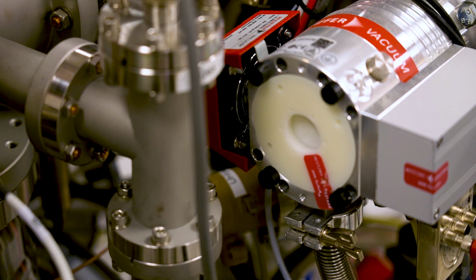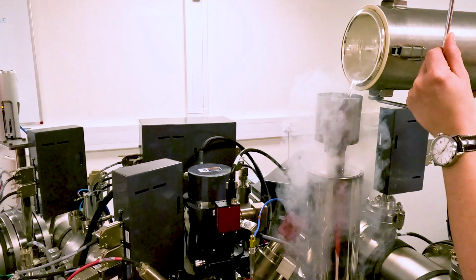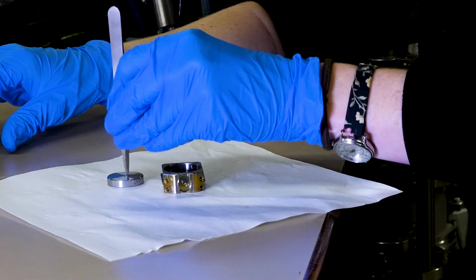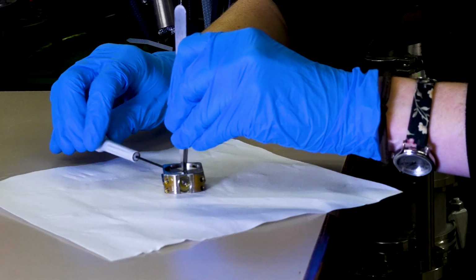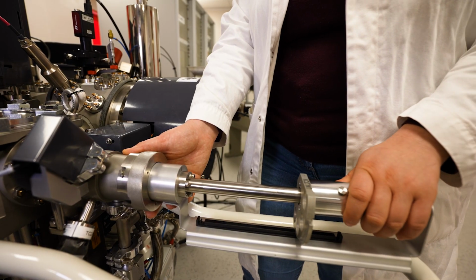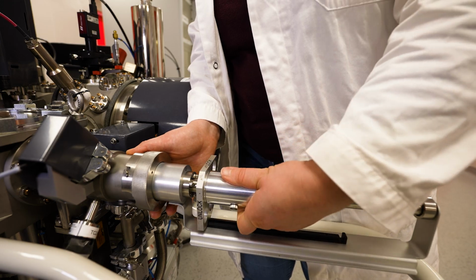No one technique can provide all the answers to everything, and by combining the high sensitivity with a technique that provides a high spatial resolution, you can provide an overall picture of where these complex chemical species are located and how they affect the materials. What this project has allowed us to do is to explore exporting techniques that are used for materials characterization in semiconductors into a totally new materials area for us, which is superalloys.